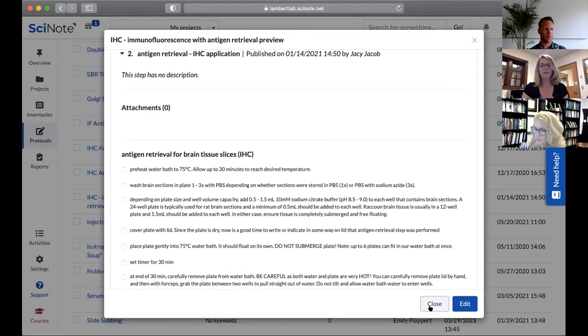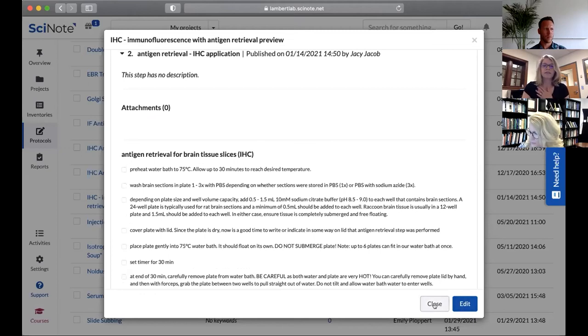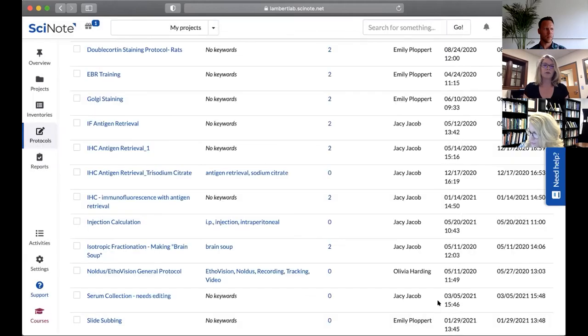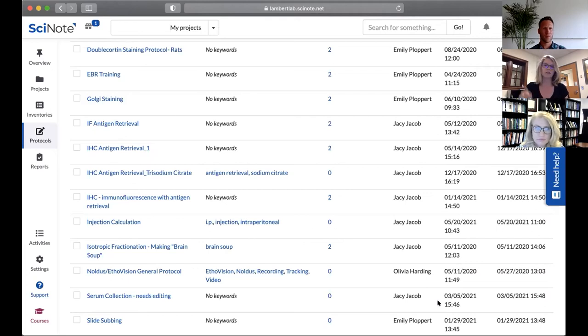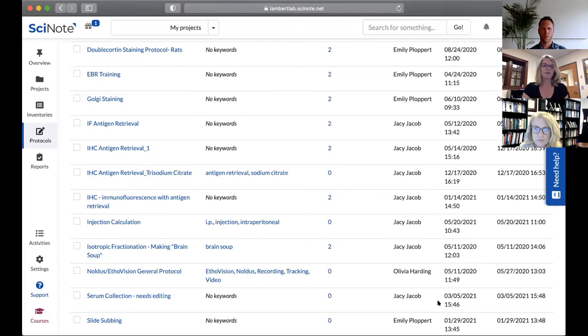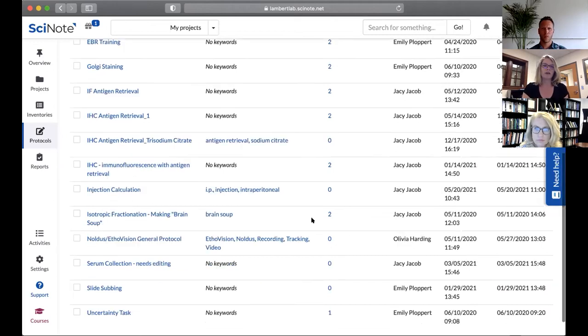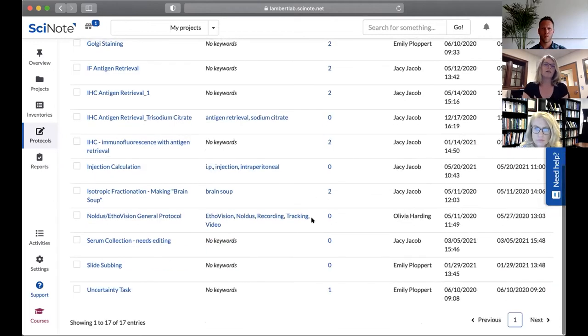Because I created this, you'll see an edit. If I did not create this, I would just be able to view it. That also helps with the fidelity of the protocols that things are not easily changed. It's not just a click of a button and it changes. This is a really nice secure way of creating a timeline of how things are done in the lab.